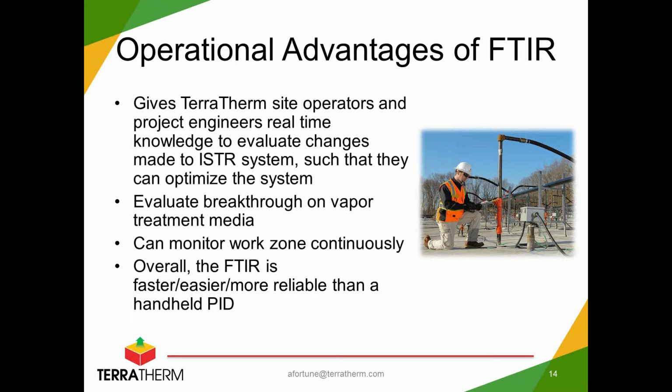So if they had to bypass something, if some part of the treatment system was down, they could easily just use the FTIR and just look on the screen to see what the concentrations were, as opposed to other traditional ways that we have typically used at other sites, like using a handheld screening device where you had to go collect some type of Tedlar bag grab sample, go back to the job trailer, calibrate your PID, screen it that way. This was much faster, and it was real time, and they could see changes happening real time as opposed to just collecting discrete grab samples.